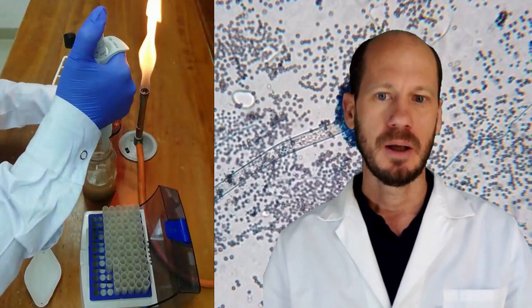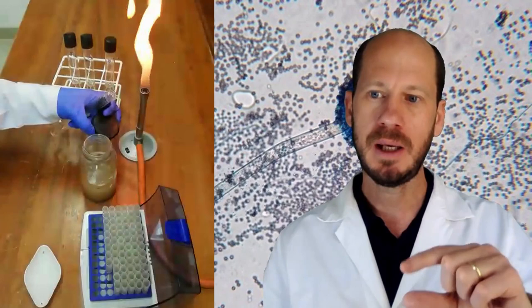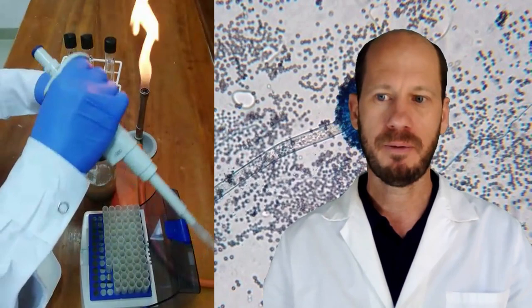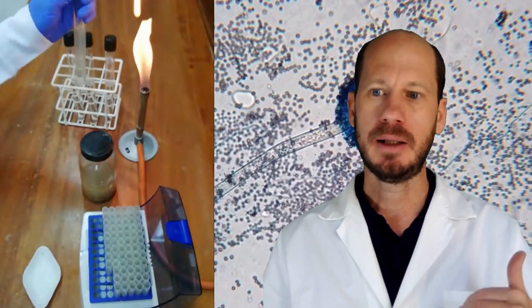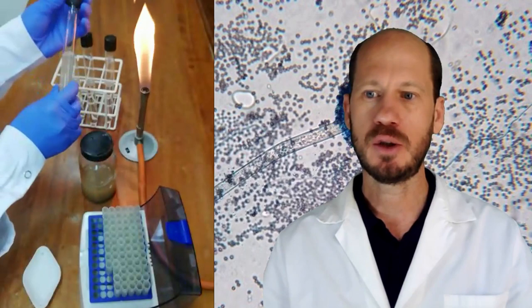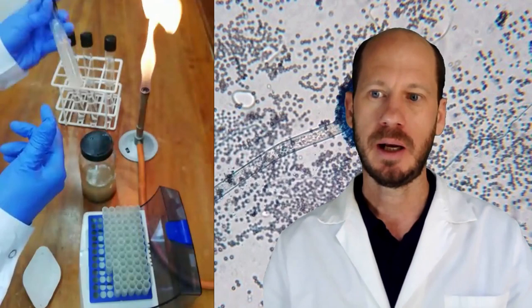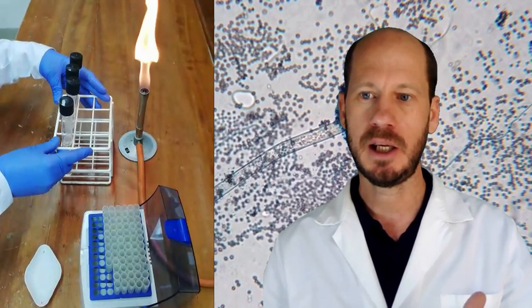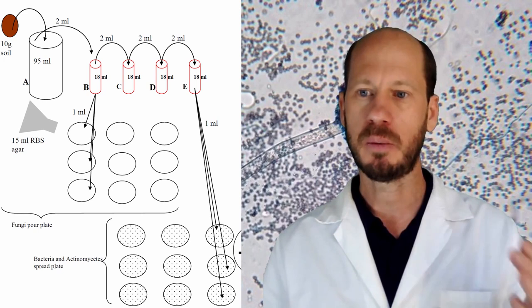From bottle B we will shake and take another 2 mL and transfer to bottle C, which will contain 18 mL of the saline solution, and so on and so forth. The first bottle will be approximately 1 to 10, meaning approximately 1 gram of soil per 10 mL of water. The second bottle will be equivalent to 1 to 100, and the third bottle equivalent to 1 to 1000. The exact proportion we will calculate based on the soil moisture. Each successive bottle will have 10 times lower concentration of microbes than the previous one.